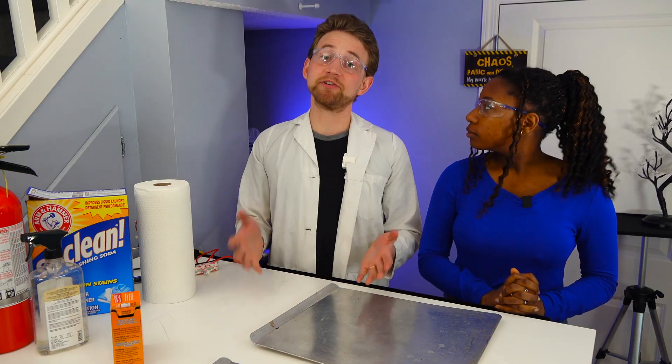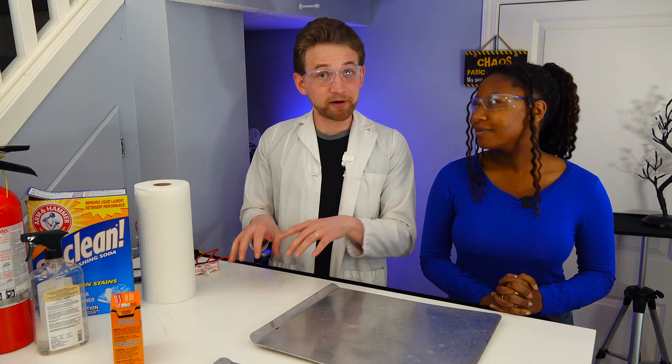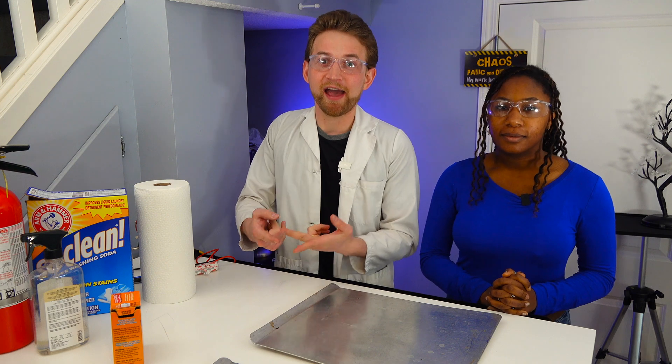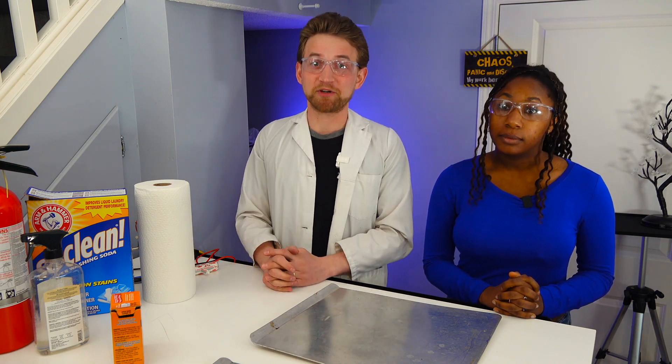Sodium carbonate is really useful, and not just for people like me who do weird experiments. I personally have used it both to make copper carbonate and climbing chalk, and my wife has used it to clean our clothes. It's really useful.